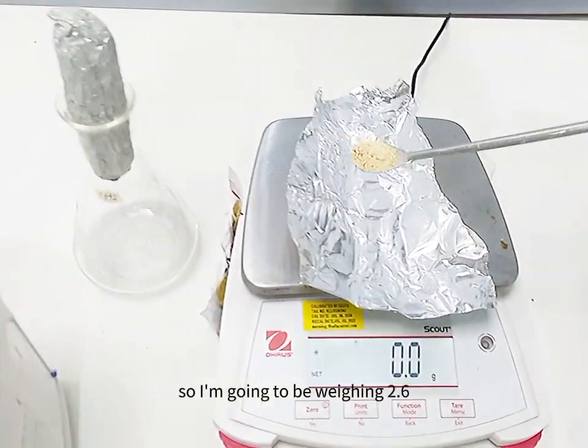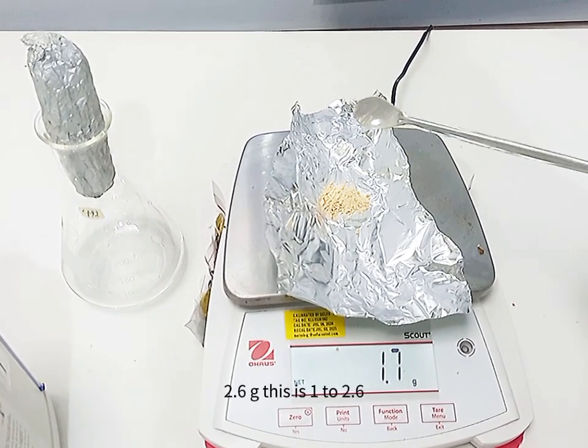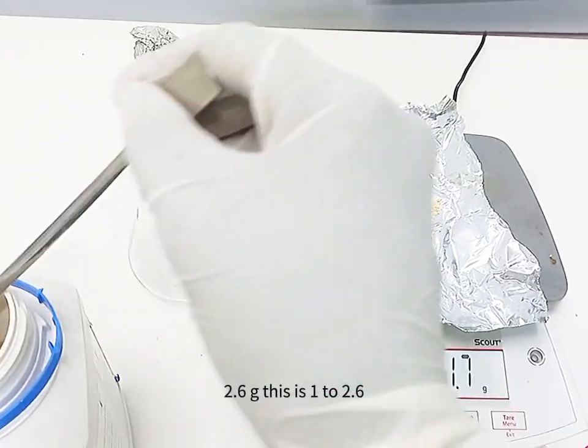So I'm going to be weighing 2.6 gram. This is going to 2.6.